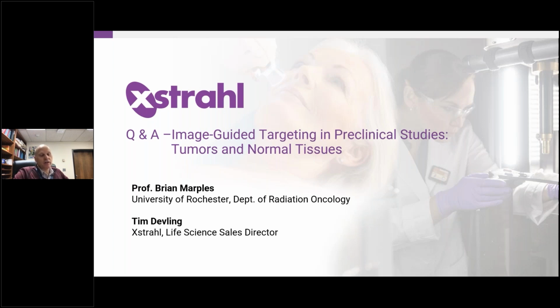We selected 30 gray because prior studies from a whole range of other investigators had used that as a baseline. So we selected 30 gray to compare our data with that baseline from other investigators, and also to ensure we've got sufficient toxicity to develop our urination assay and other assays that are described in the paper that I didn't talk about today.